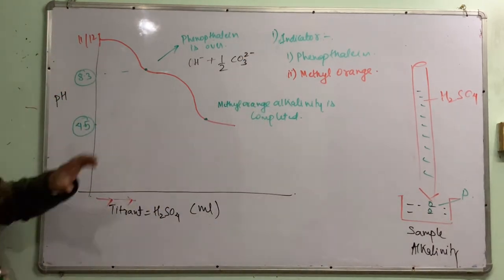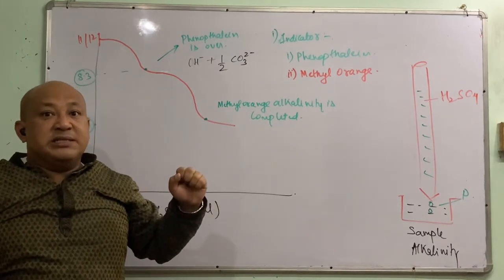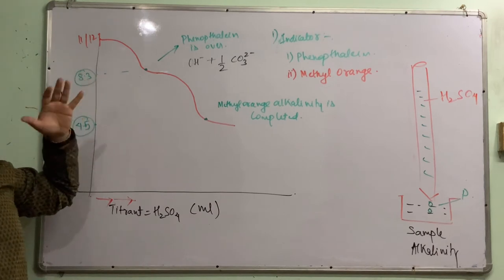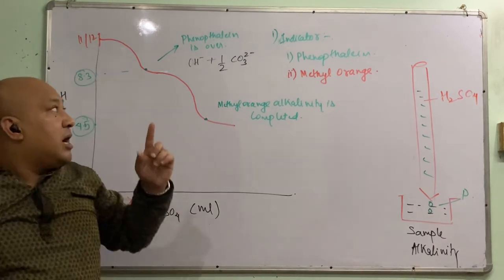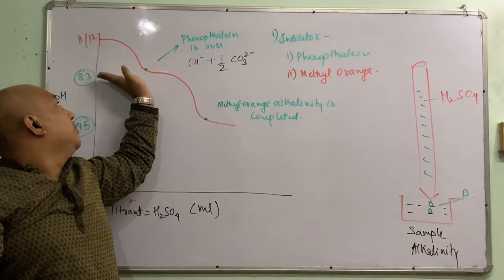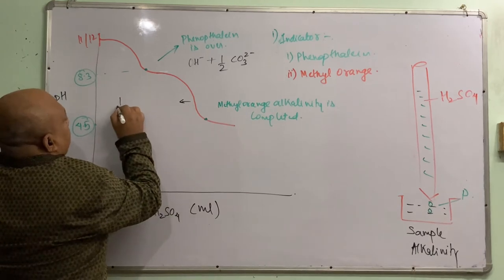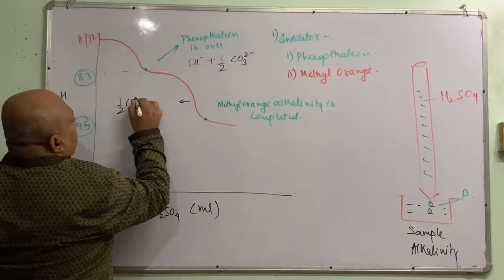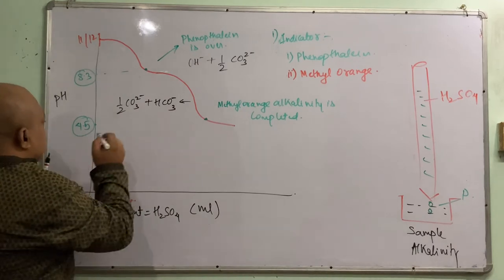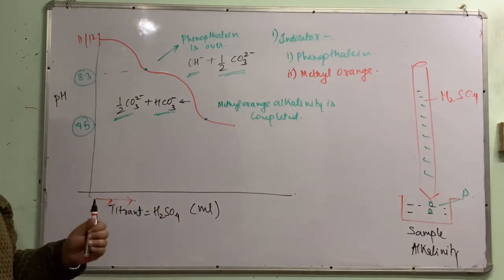Okay. So, I told you this alkalinity is what neutralizes the acids. That capacity is called the alkalinity, and that is phenolphthalein alkalinity. Till pH 8.3, the responsible ions fighting against the neutralizing of acid are the hydroxyl ions and the carbonate; half of the carbonate is consumed by 8.3. And whatever half of the carbonate is left will be used over here, plus the bicarbonates. So these ions complete the phenolphthalein and methyl orange alkalinity.